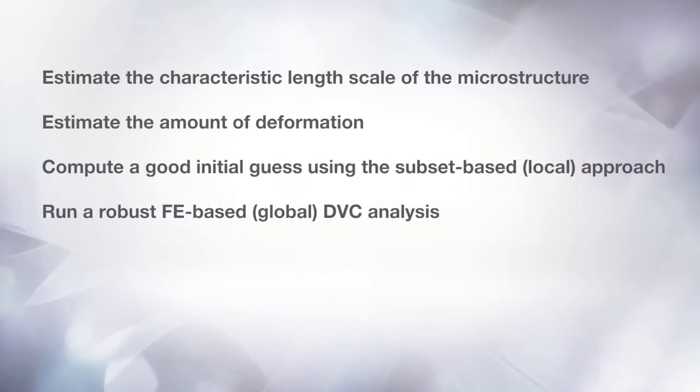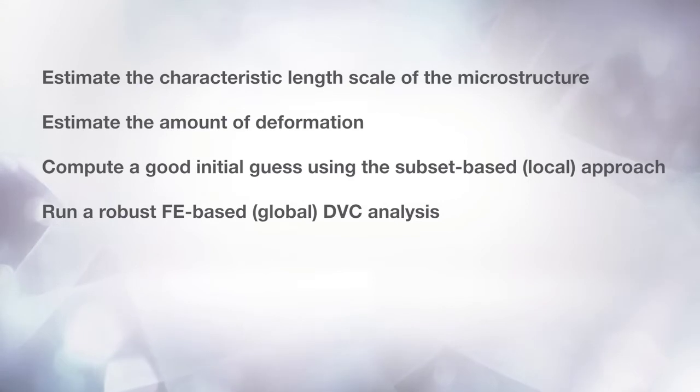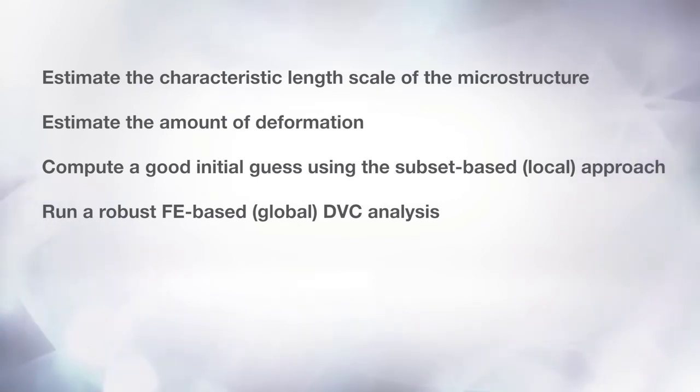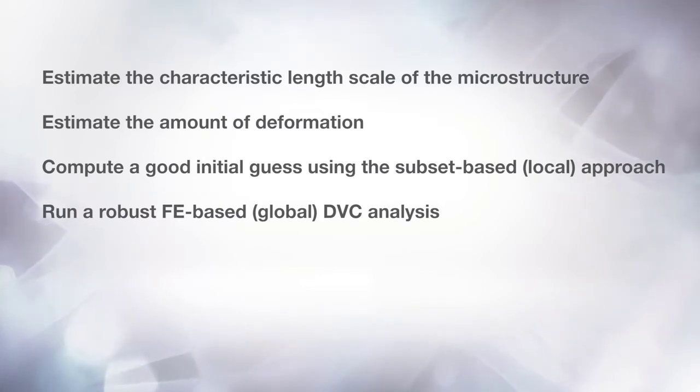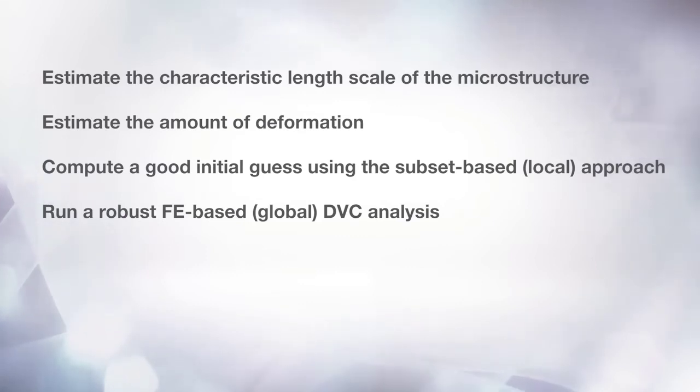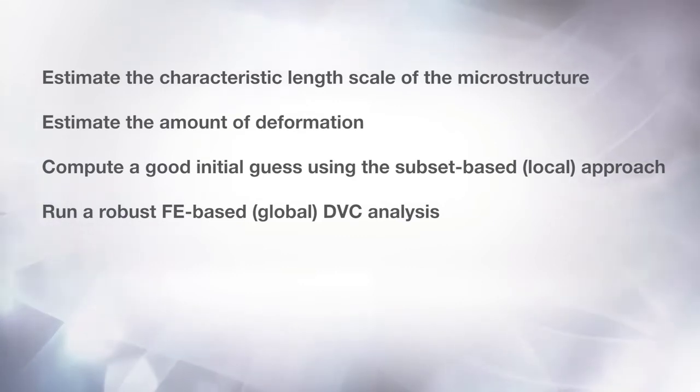First, you will learn how to estimate the characteristic length of the microstructure, as well as the amount of deformation in a series of images prior to performing a DVC analysis. Then, you will learn how to use the two approaches to DVC included in the Digital Volume Correlation module, and how to visualize the results of the computation.